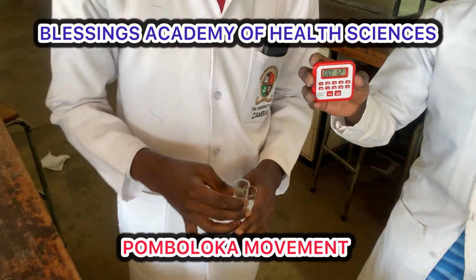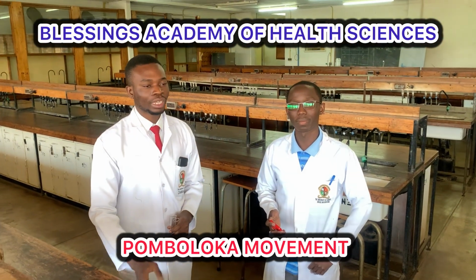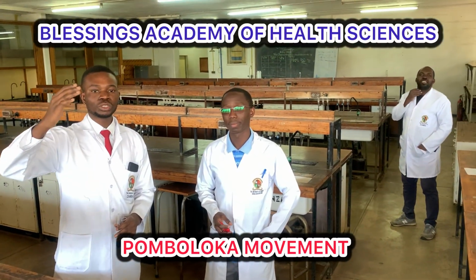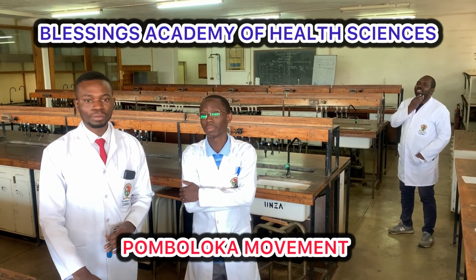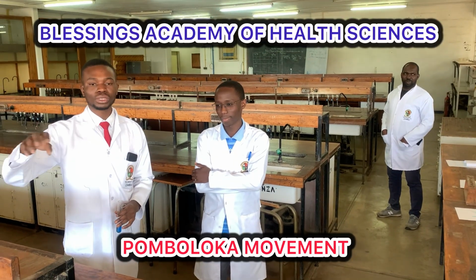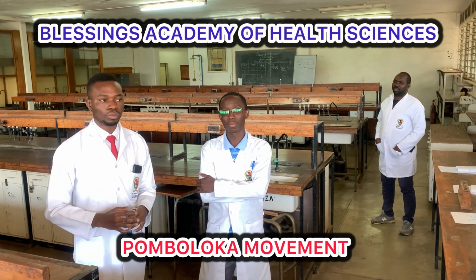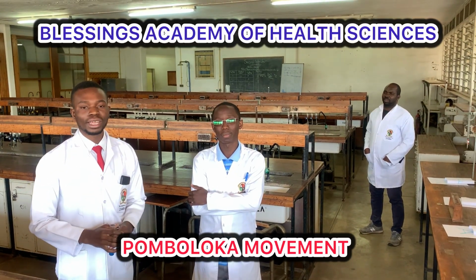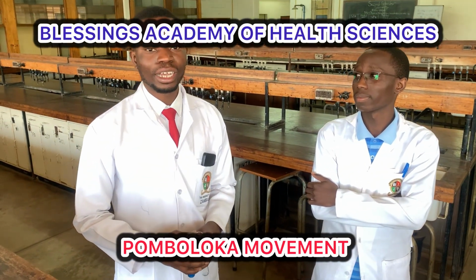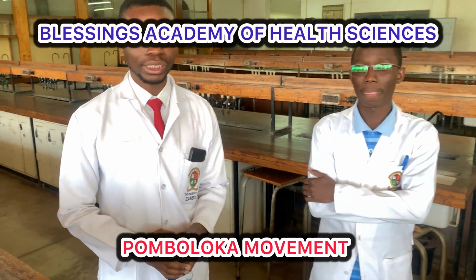Exactly. So this is how you carry out the experiment. And remember, we've been given a table we're supposed to fill in. From 4.5 mils of A, we're going to move into 4 mils of A. Remember, we're going to again add distilled water, mix with sample B, and then repeat the exact procedure until we fill in the entire table. So this is how you conduct the lab session, and we wish you a wonderful time throughout the entire lab session.